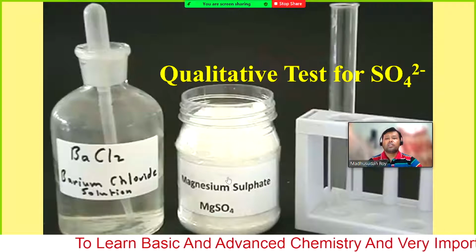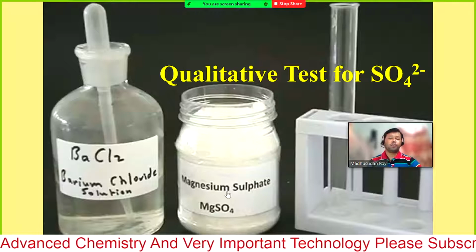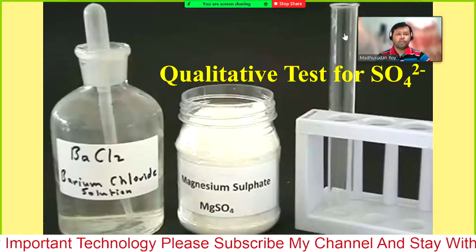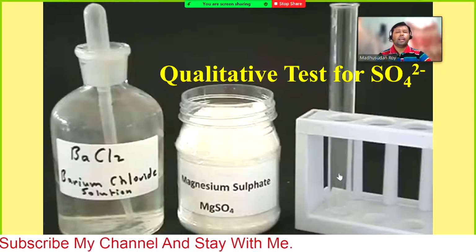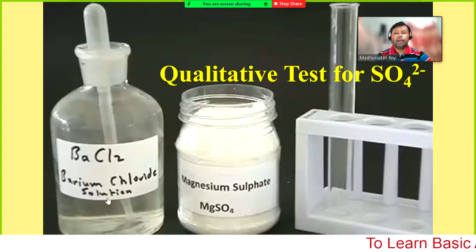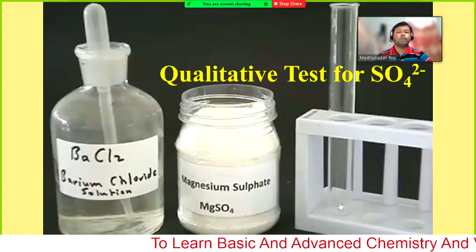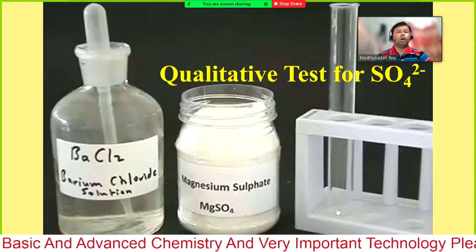So first, this is your salt, magnesium sulfate or calcium sulfate or whatever, any sulfate salt. Take some sulfate salt into a test tube. This is our empty test tube. Take the salt into a test tube and then dissolve it in distilled water. Add some water to the salt and shake it very well, and then add barium chloride to the test tube. When the magnesium sulfate is dissolved in water, that gives you the original solution, known as OS.